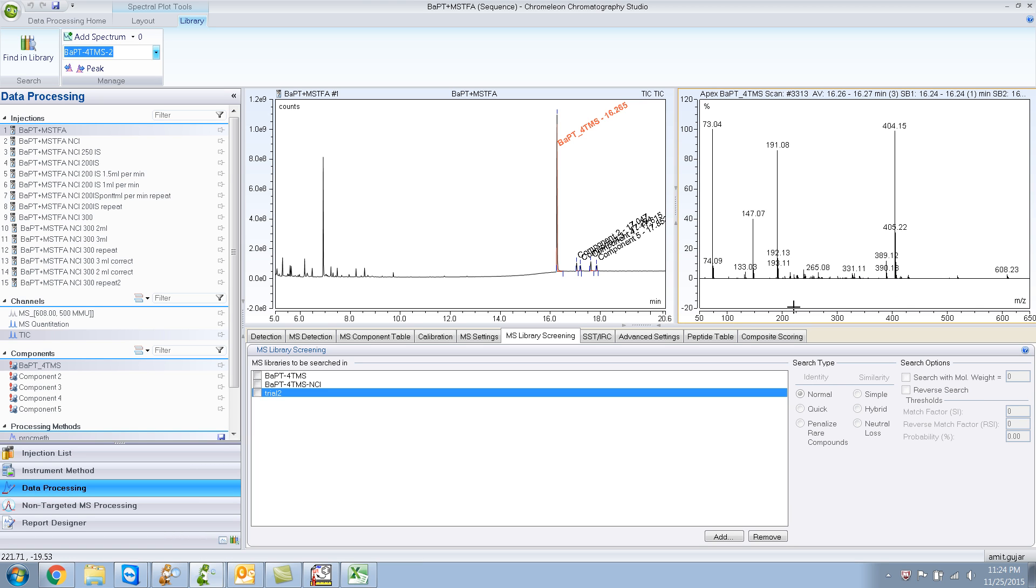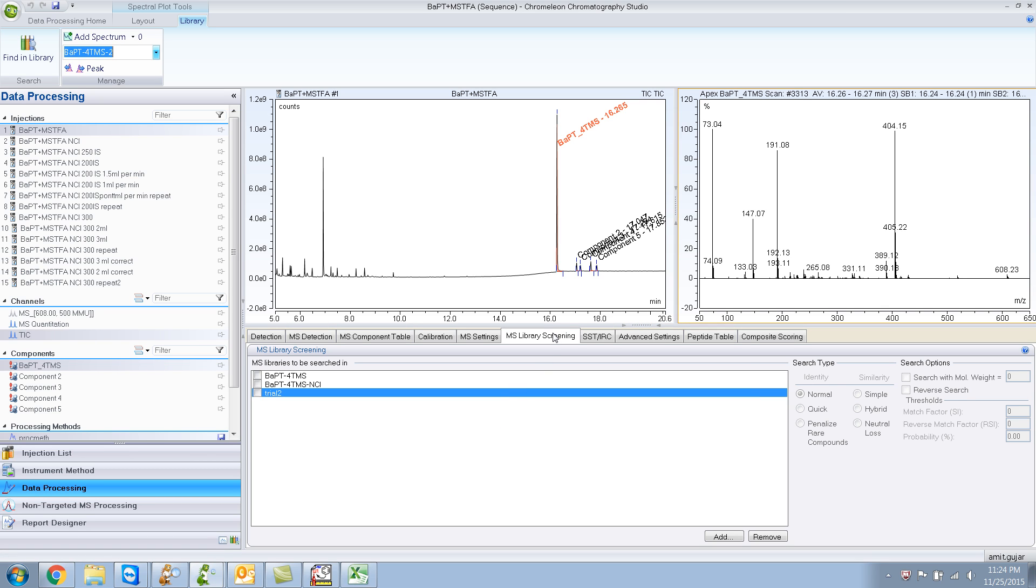But you need to add it to your MS library screening processing method. Basically, you need to add that library in your processing methods in order to search the library.